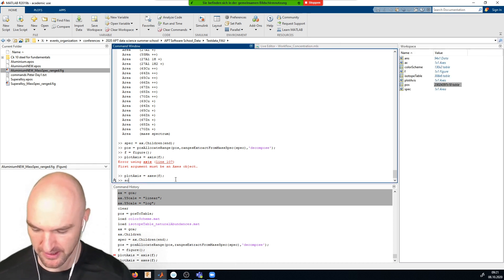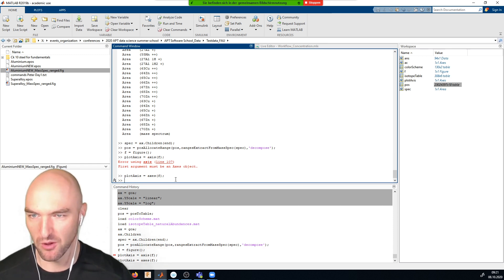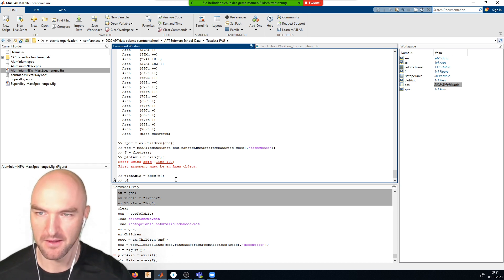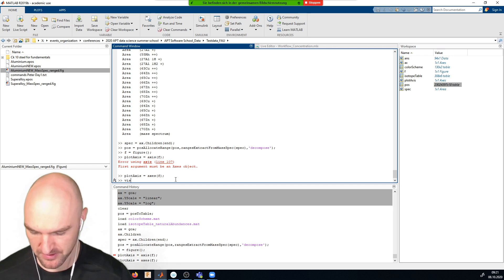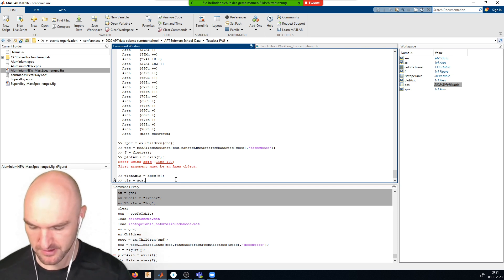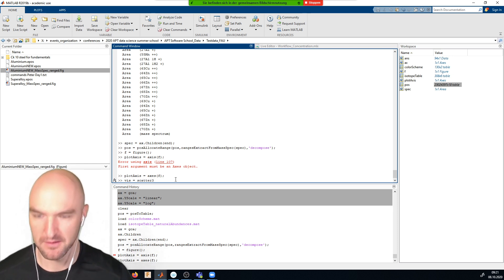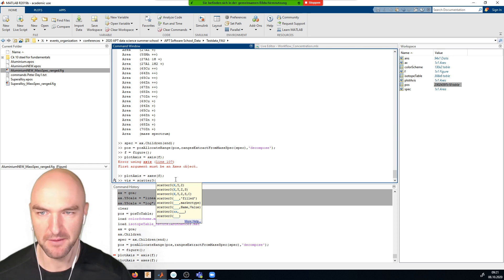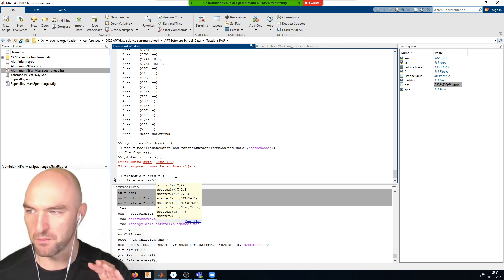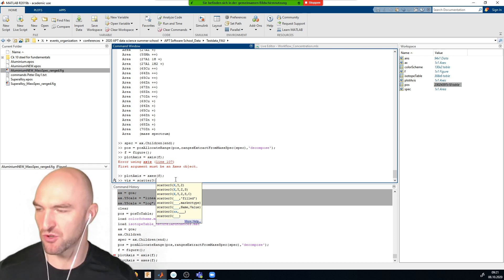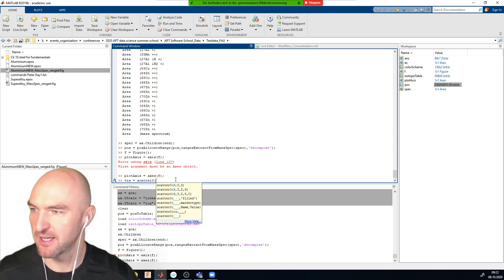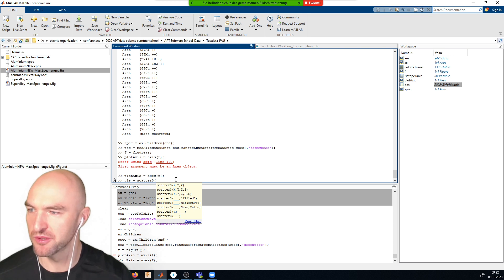Now we have an axis and we want to plot our 3D data into it using the `scatter3` command. I'll call the scatter plot handle 'scatter group' as our visualization object. It's a three-dimensional scatter plot requiring x, y, and z coordinates. Renell, you should have received the ranged mass spectrum by email yesterday — if not, talk to one of the hosts.